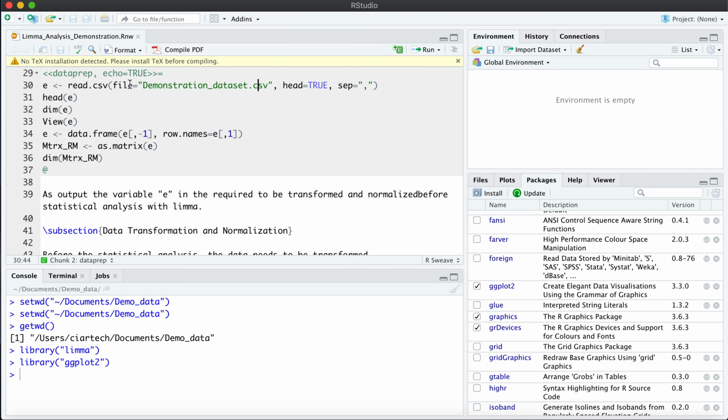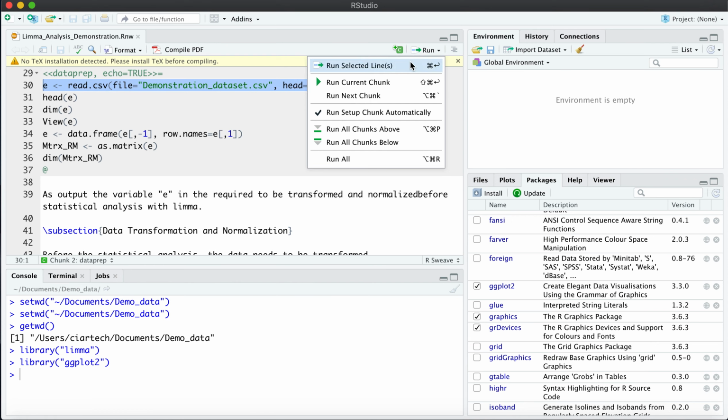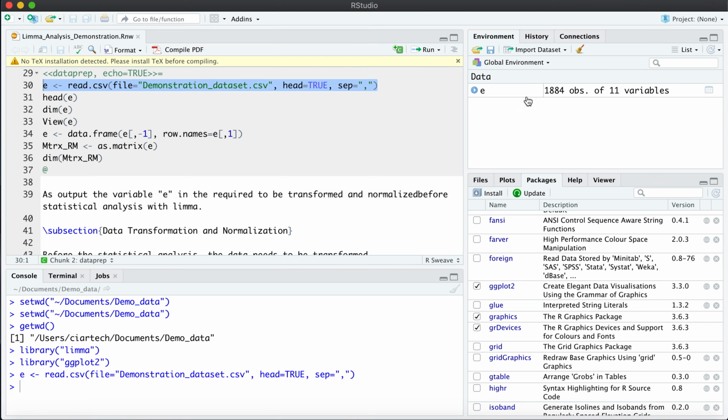If it's CSV, we need to specify that it's separated by comma. CSV stands for comma separated values. And we just load the line and we can see it here. As I described in the RStudio videos, on your right in the environment you are going to see variables, functions, lists, every data object, and it will also display in the console the last commands you ran.